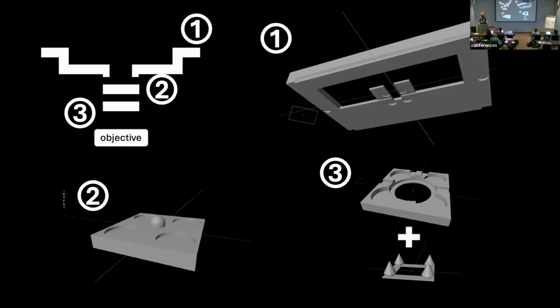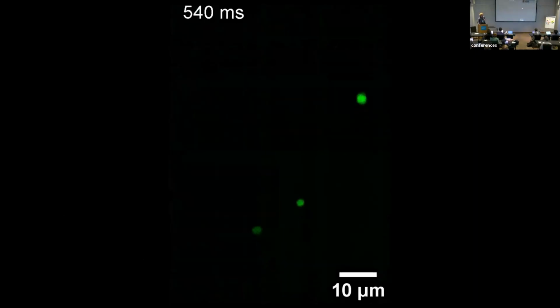So what are the results? One of the coolest videos that I managed to record is a wave of neutrophils inside a blood vessel of the intestine, which looks like it's walking. So this is definitely one of the coolest things.